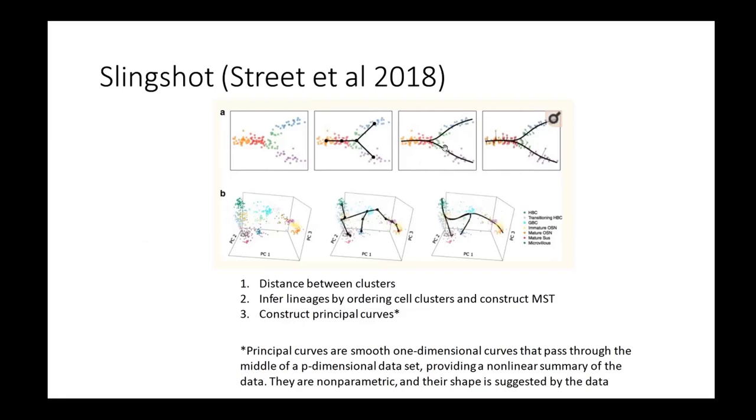So here, for instance, in that example, they have generated two curves. At the beginning, they're sort of together, but they divide. So you have a bifurcation here. You could also have a multifurcation in that method. And what's important is that you have some cells that might be part only of one curve and some cells that might be part, as those here, of both curves.